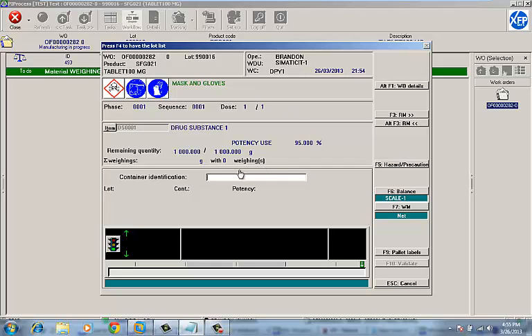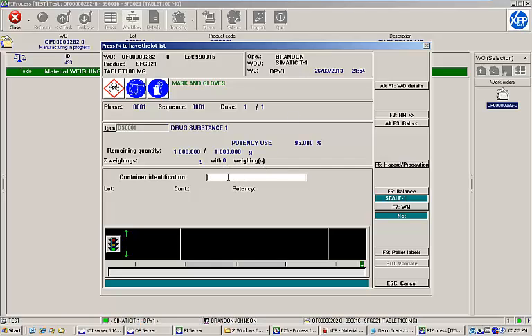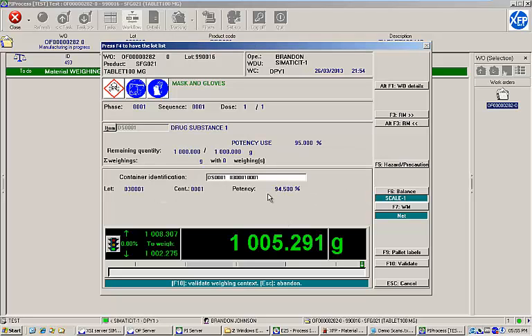I'll scan a container of Drug Substance 1. The details of the container are displayed below the container identification field. The lot number, container number, and potency are all visible.